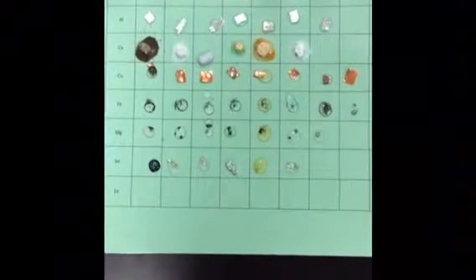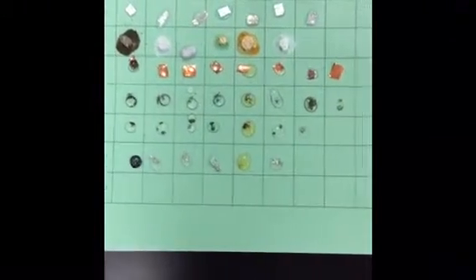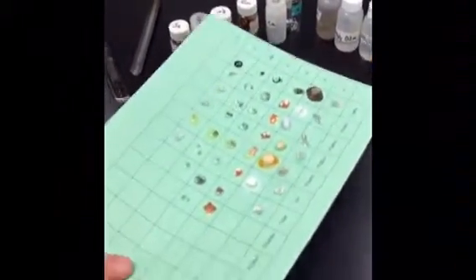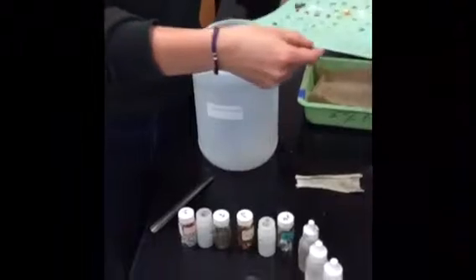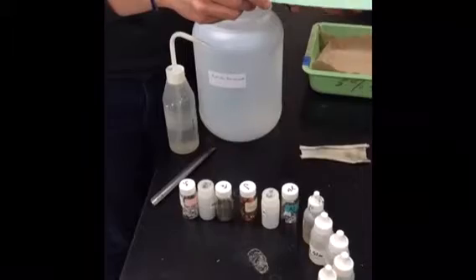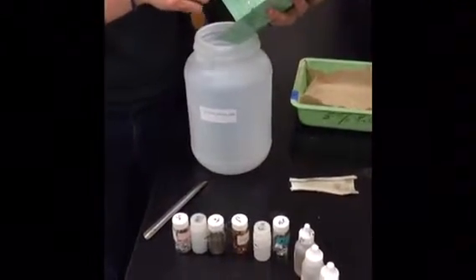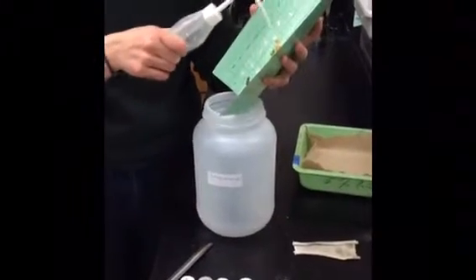Finished, your grid will look like this, and you'll be able to record all of the chemical changes that you see. After you're finished, you're going to take your grid and carefully walk to the waste container, and using a squirt bottle, fold your paper into a funnel and squirt all of the reactions into the waste.